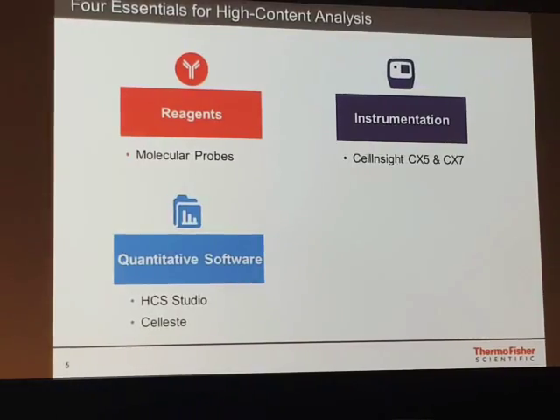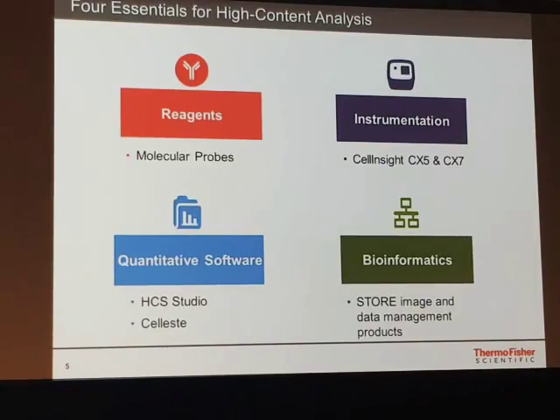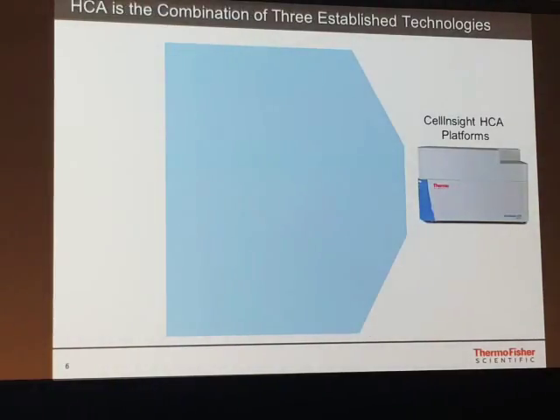You have to keep in mind you need really strong and powerful software that can take those images, analyze them and convert them into graphs and data so that you can understand what your population of cells is actually doing, right? And because we take not only a few images, we take thousands of images, we also need all the IT and server capabilities to store those images and go back to track what cell was doing what. And I will come to that in the future.